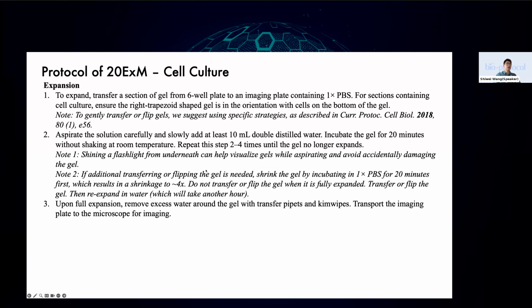Finally, when you're ready to expand and image, if you cut the gel to 0.5 centimeter, after expansion it will expand 20-fold. So that will be around 10 centimeters. So it's quite big. Am I doing the math right? Yeah, 10 centimeters. So it's very big.